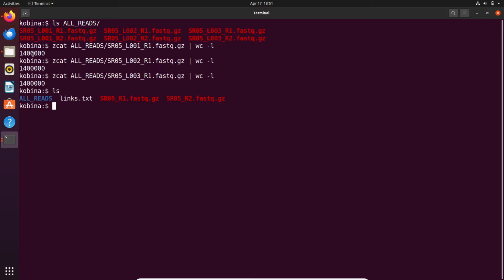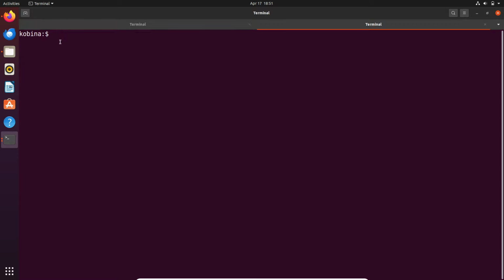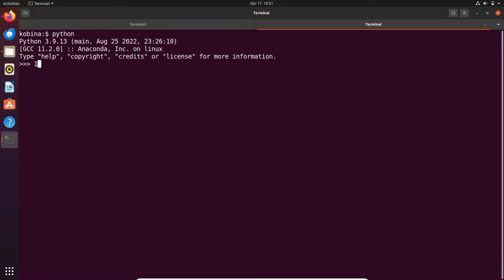If you sum them up, what will you get? Let's use Python. 1.4 million times 3 is 4.2 million.